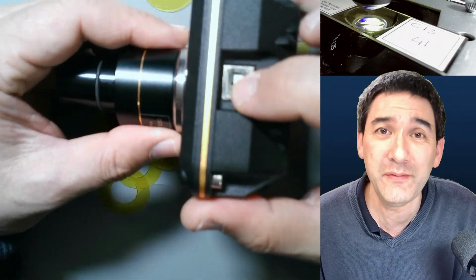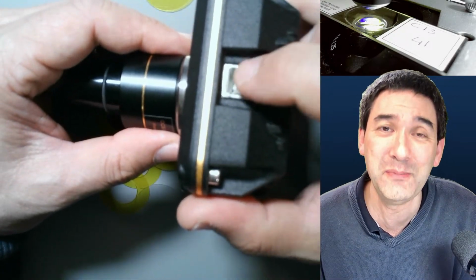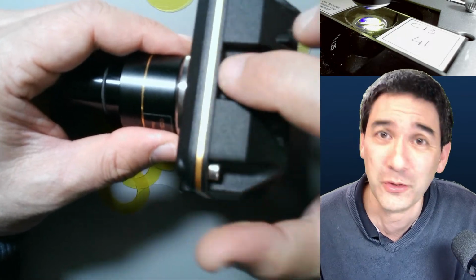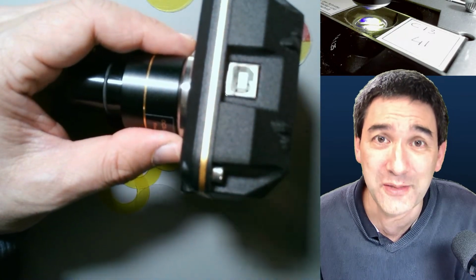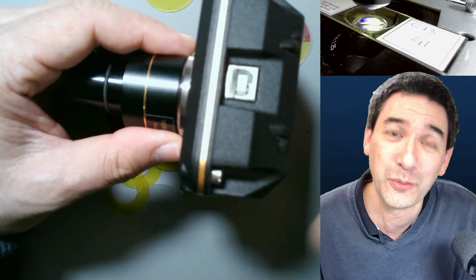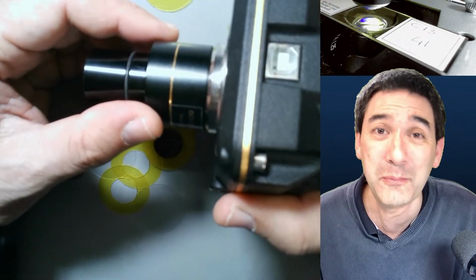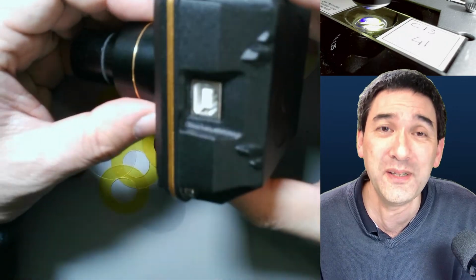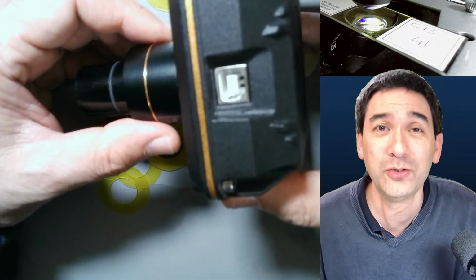And then you have a slow USB connection. This means you do not get a high frame rate for video. It's fine if you want to take still images, but the camera connection is slow, unless you have USB 3.0. So there are multiple factors, but these cameras have one important advantage, and they're really convenient.